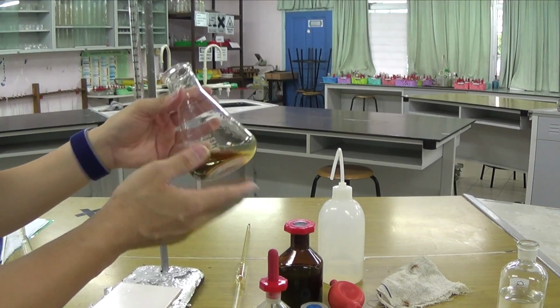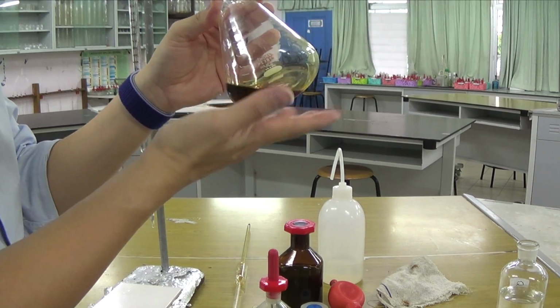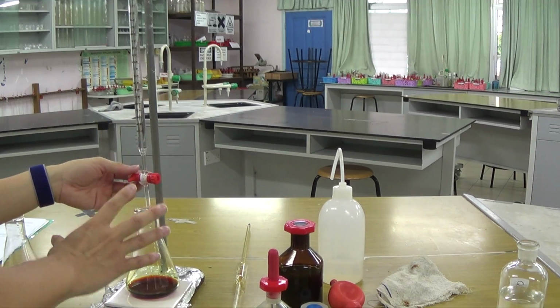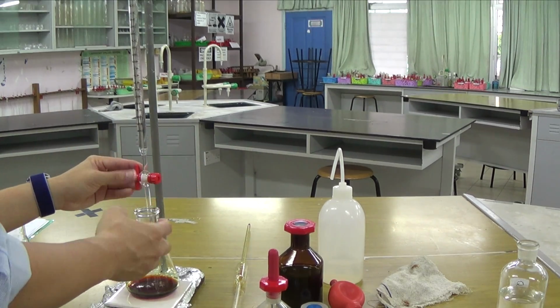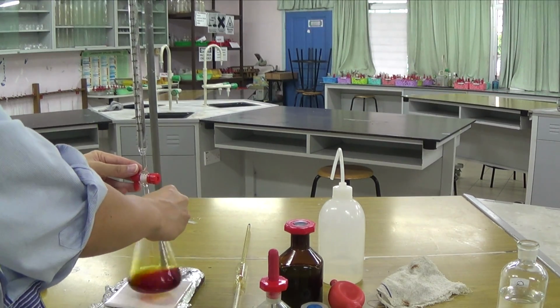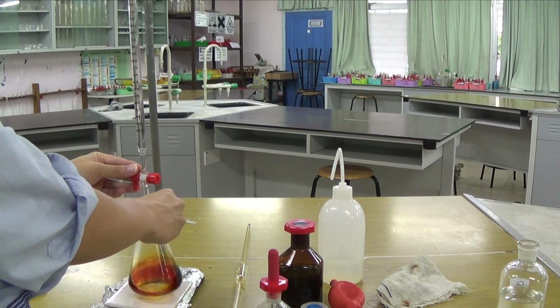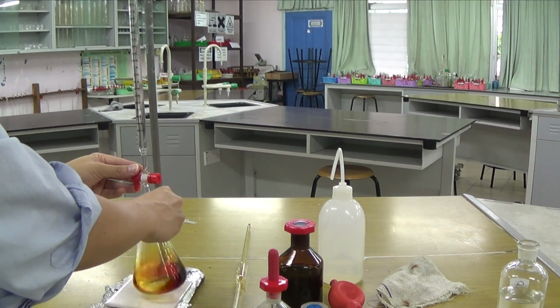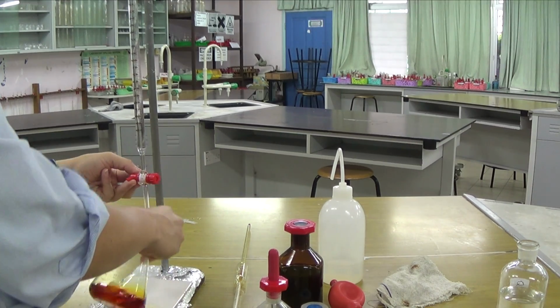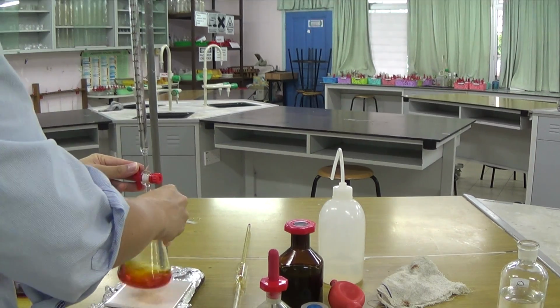We don't add our starch straight away, we add it when it gets a bit more diluted. When most of the iodine is almost gone, then it goes almost yellow. This is now brown, okay? So I'm doing a rough titration. I don't really care about where I stop, so I don't slow down at all. I just wait until it gets a bit yellow, then I will add my starch indicator. It's still a bit brown. We must remember to add our indicator because without the indicator, we might not see a very sharp end point. So it's getting a bit lighter now. As you can see, it's not as brown as it, well actually it's still pretty brown actually. So let's add a bit more.